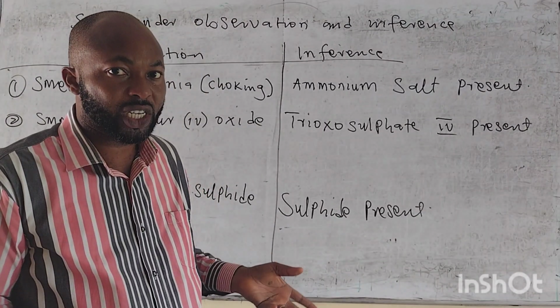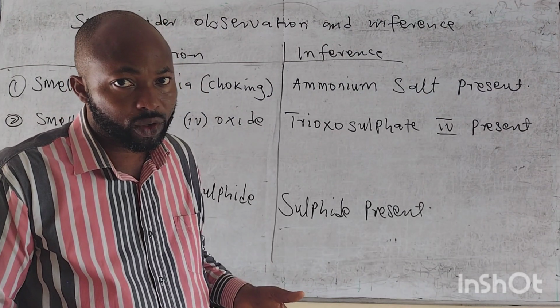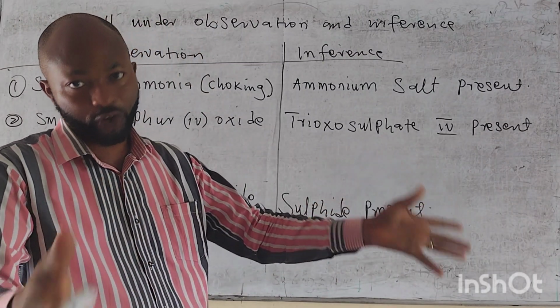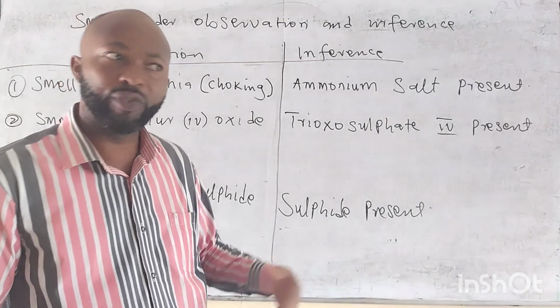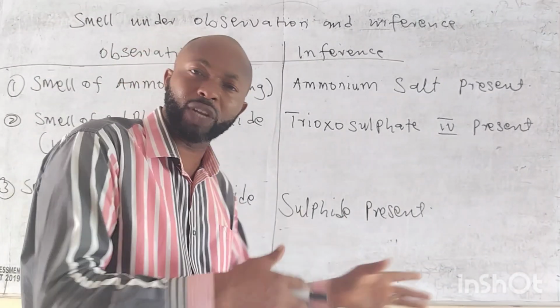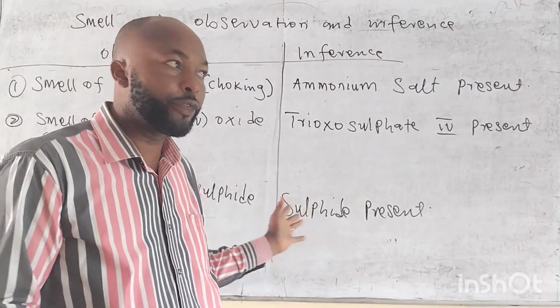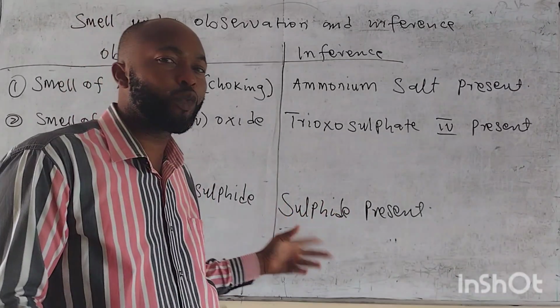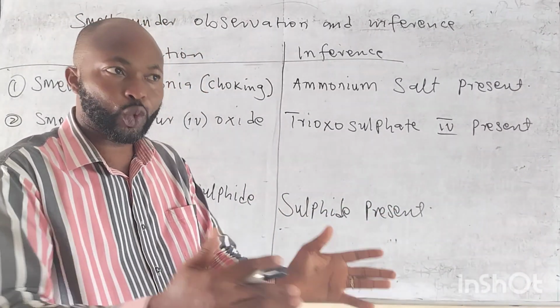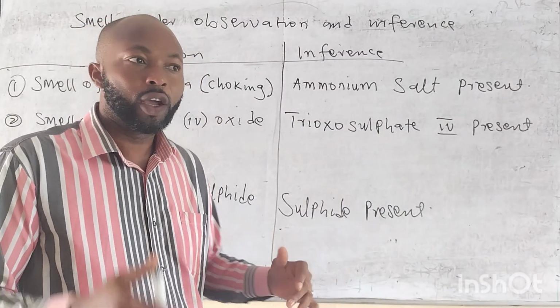Okay, good. You are suspecting it's copper. Now, is copper soluble in water or not? If it is not soluble, you put it in water and see it is not soluble. Now you cannot confirm, okay, obviously it's copper. But if it is soluble, and copper is not soluble, then your mind goes to any other color related to that blue, and so on and so forth. If it is white, the various cations that have white color, you've been able to streamline them out. Now, of these, how many of them are soluble in water? You now check, only one or two is soluble.